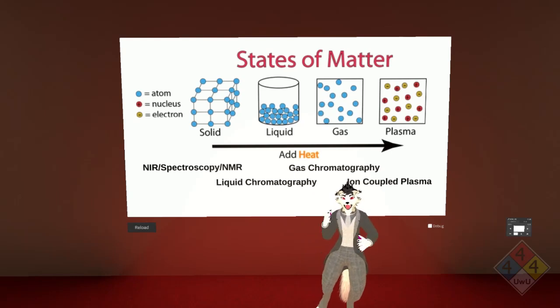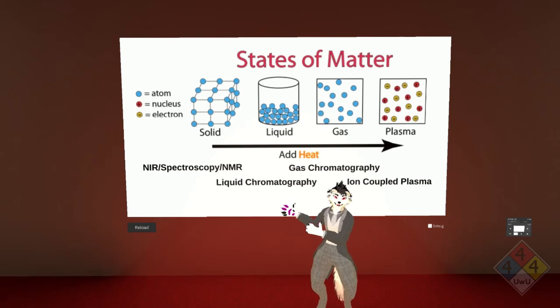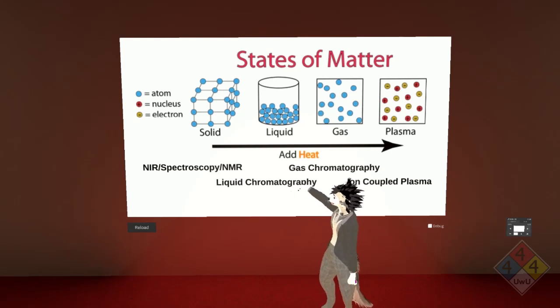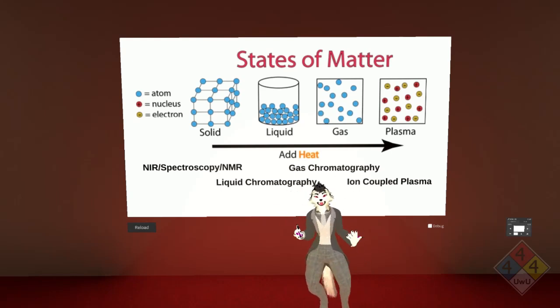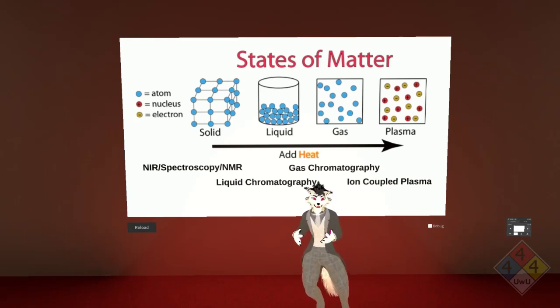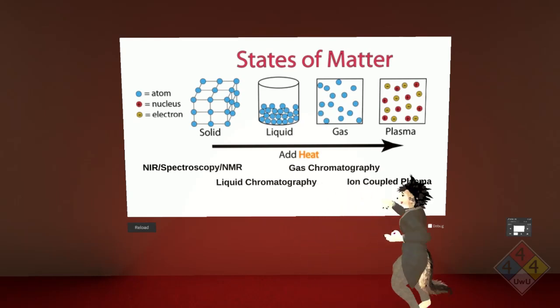But there's a lot of science that comes in before using that fancy flashlight, because spectroscopy, in reality, is a surprisingly simple concept, but again, a lot of science can go into it. And I threw NMR in here just as a discussion point, but we don't use NMR in cannabis laboratories. That's kind of overkill, but those would also be used to analyze possible physical samples.